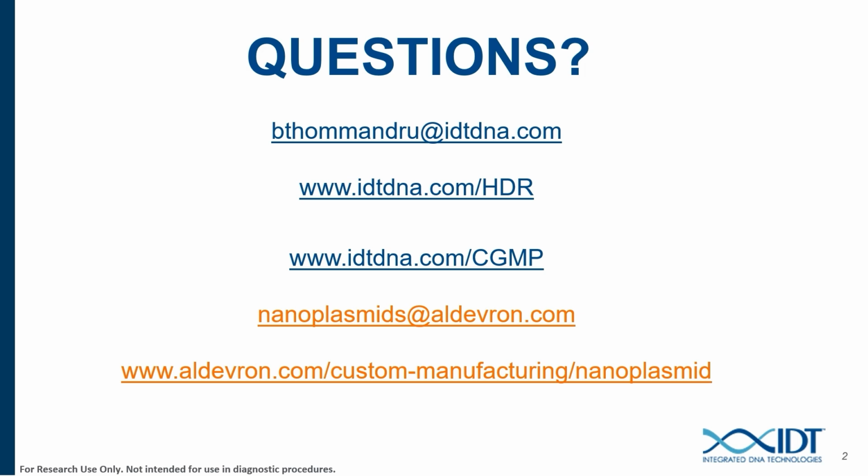Thank you, Bernice. Another question here. How do you measure cell viability and HDR efficiency? For cell viability, we do flow cytometry or occasionally the Presto Blue assay, which is a commercially available resazurin conversion reagent for measuring cell health. For measuring HDR efficiency, we would again use flow cytometry or occasionally NGS in the form of Illumina sequencing, and also long read ONT sequencing.